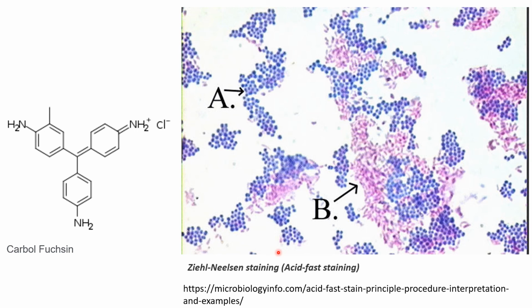So that's the end of this presentation. Just remember, we use simple staining to differentiate the background from the cell. We just want to increase the contrast to determine the arrangement and morphology of the cells. Another thing, most of the examples are positive staining.